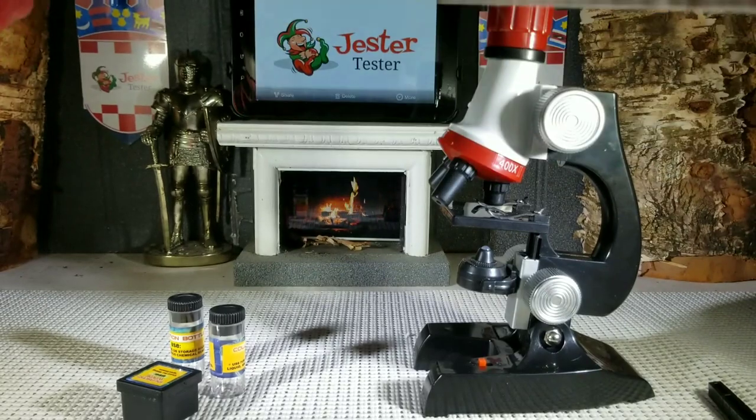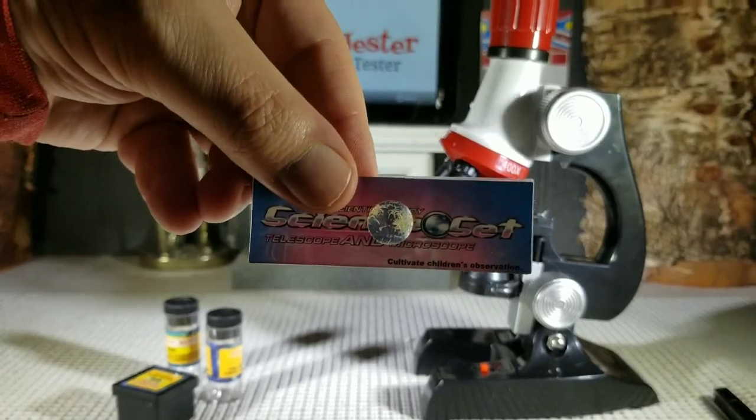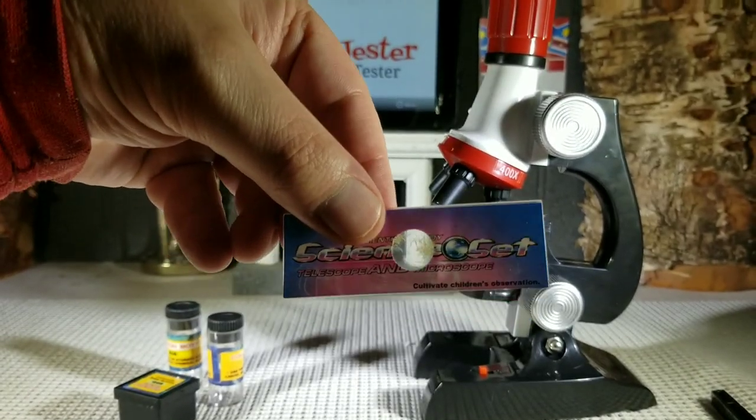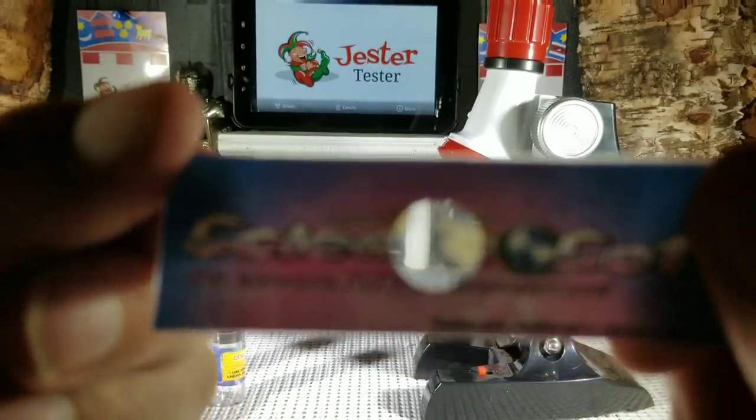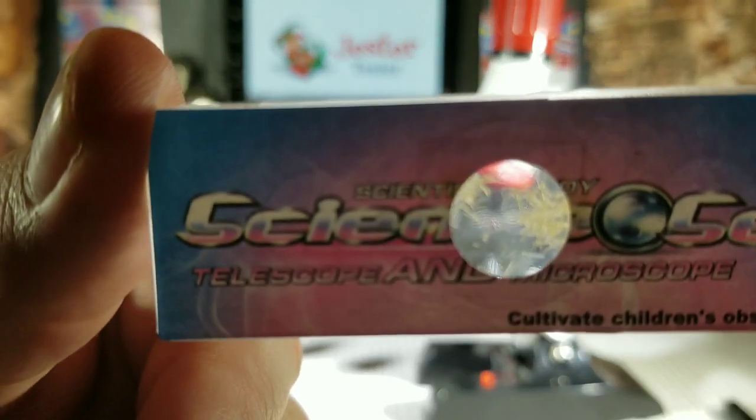You also get one pre-made slide that already has a sample in it. The sample appears to be a straw material — a fiber.